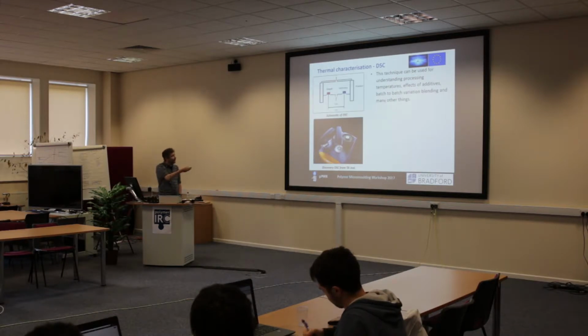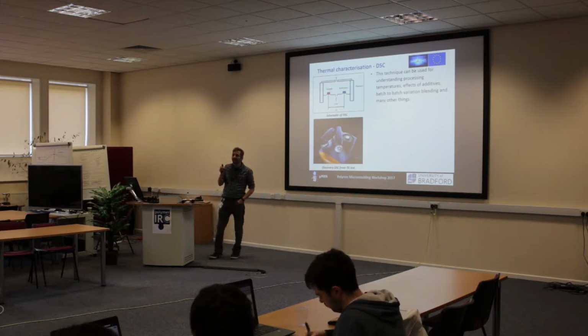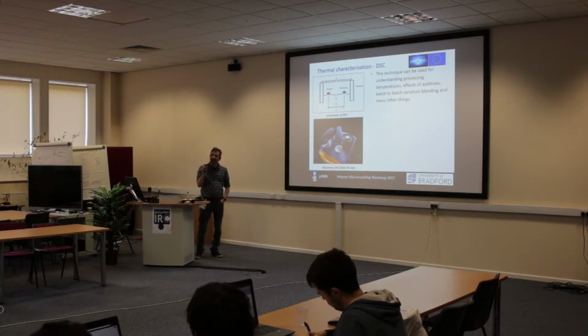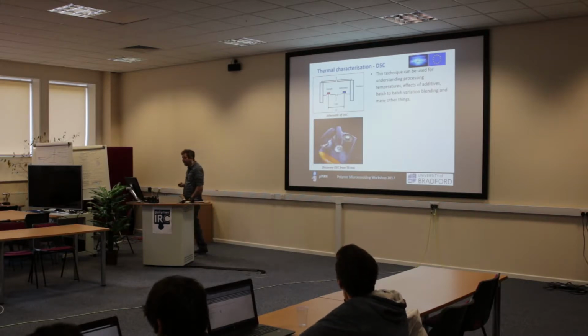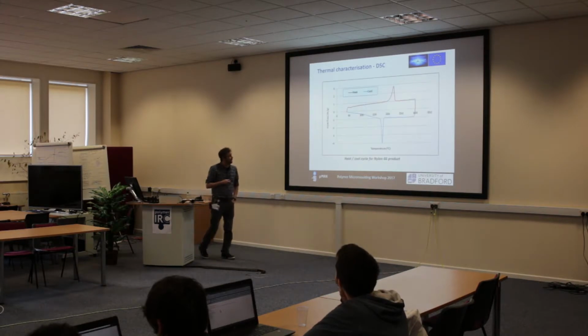But actually, the work is simply these two little nubs in there, okay? And this is what it does. You put your sample in a sealed metallic pan, okay? Generally, aluminium is absolutely fine. We need to know the mass of that. We need to know the mass of the sample. And we compare the thermal history of that, the enthalpy that's in the material, or that we're measuring, with that of an empty reference pan, okay? So we've got a reference pan on one side and a sample pan here, okay? And what it allows you to do is to see this, okay?